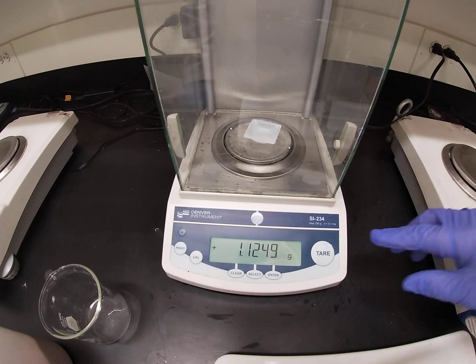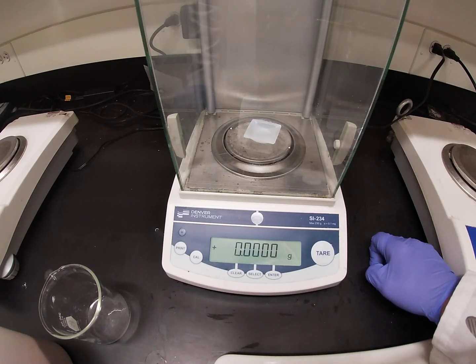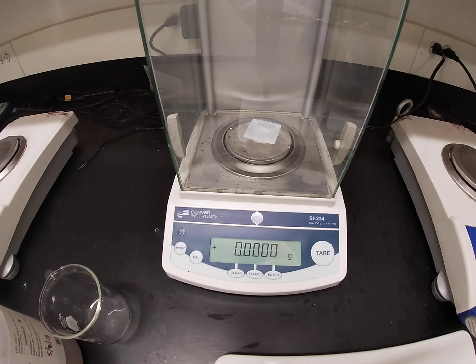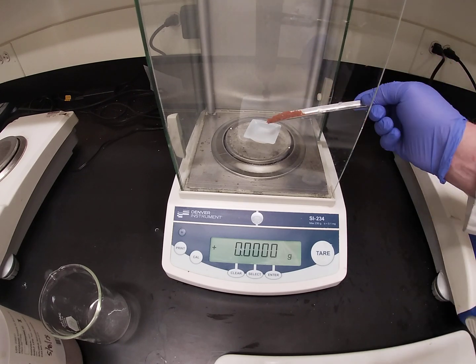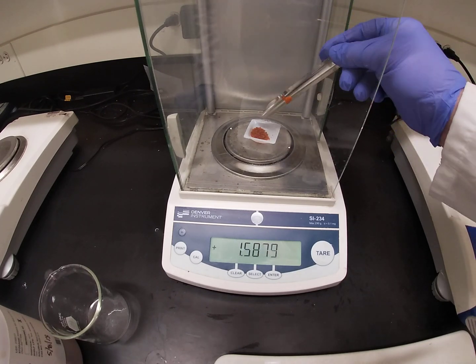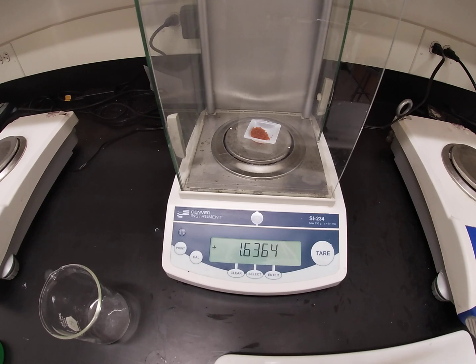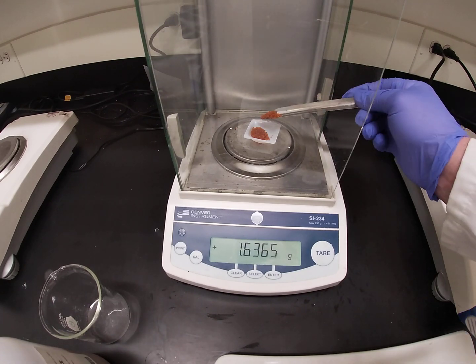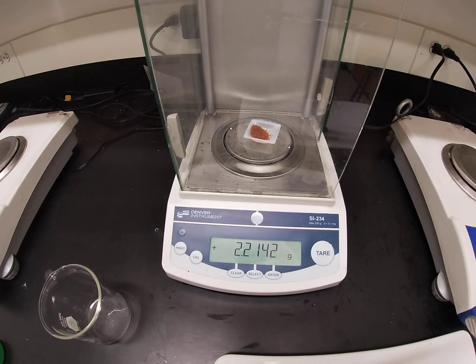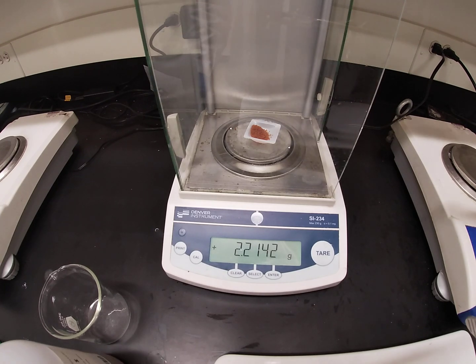Here we are in the balance room. We're going to tear a weigh boat — a plastic container — on the scale, and measure out approximately 2.9 grams of cobalt nitrate hexahydrate. Hexahydrate means there are six water molecules in the formula, so within this compound there is not only cobalt nitrate but also six water molecules.